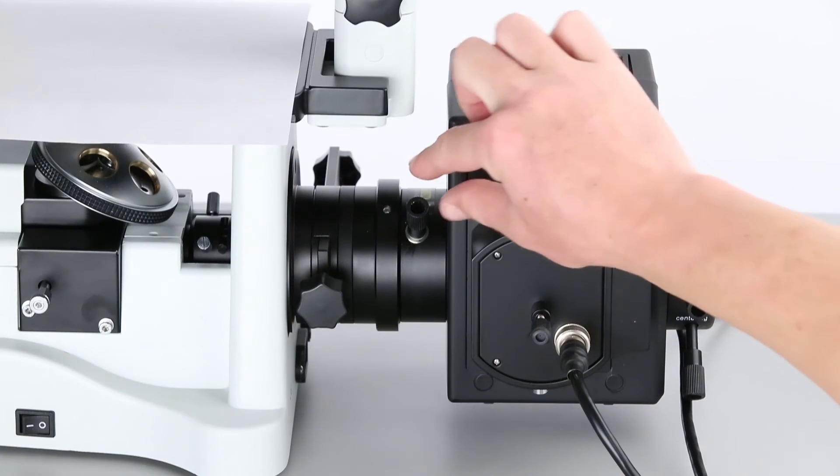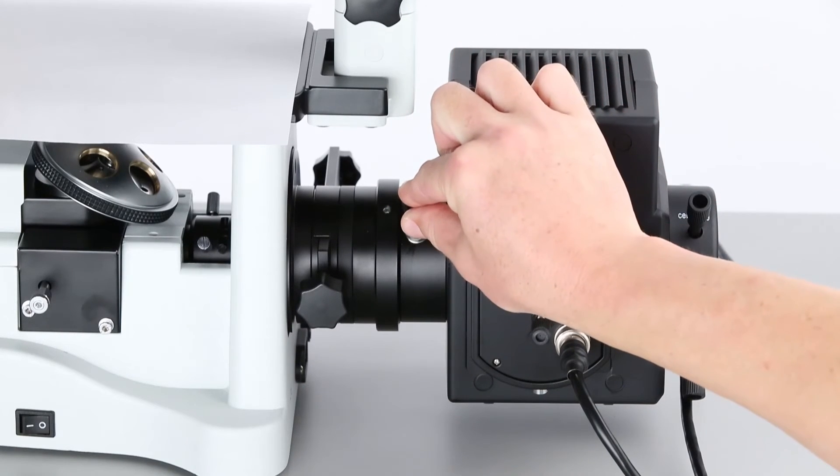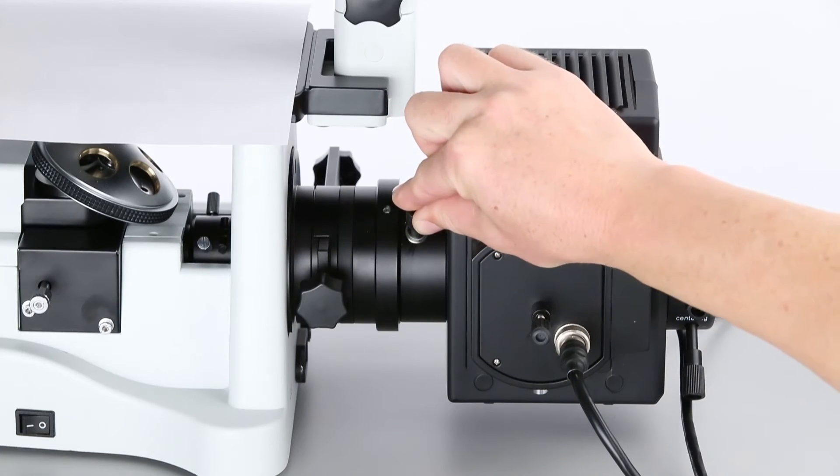We'll start by adjusting the primary focus. This control is located between the body and the lamp housing. The aim here is to make the light projections as finite as possible.